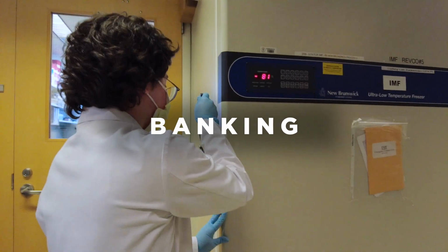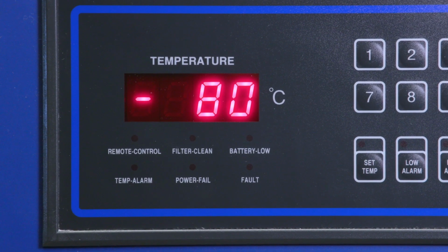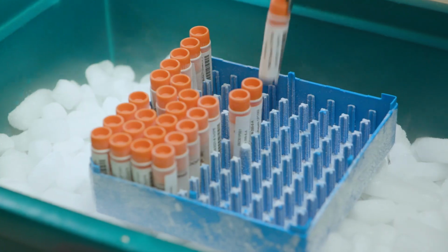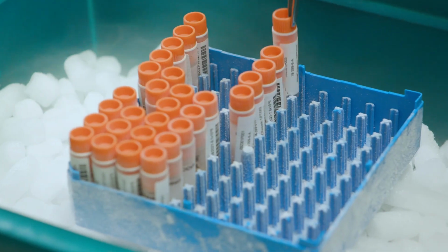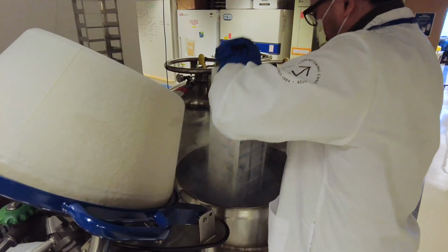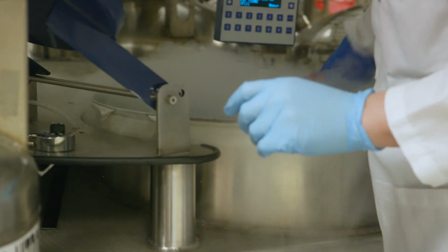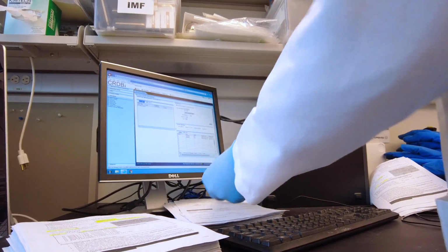The samples typically stay in the -80°C freezer for 24 to 72 hours. Then they are taken out of the cooling containers and placed into cryo boxes and are ready to be moved to liquid nitrogen freezers. A lab member refers to the current freezer map to find the next available slots in the liquid nitrogen freezer for the samples to be placed and documents their location as part of sample inventory management to ensure accurate sample tracking.